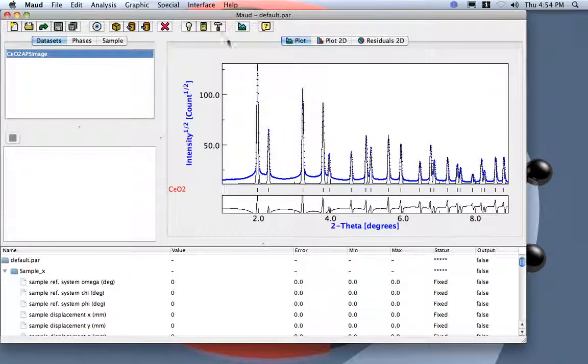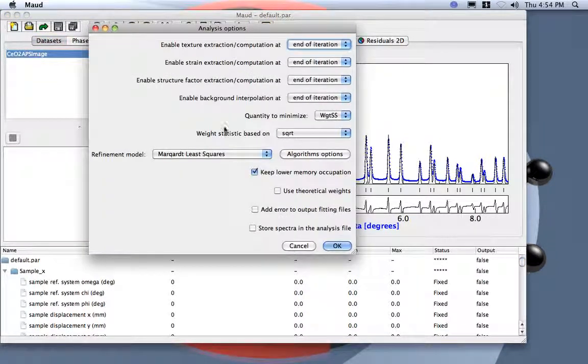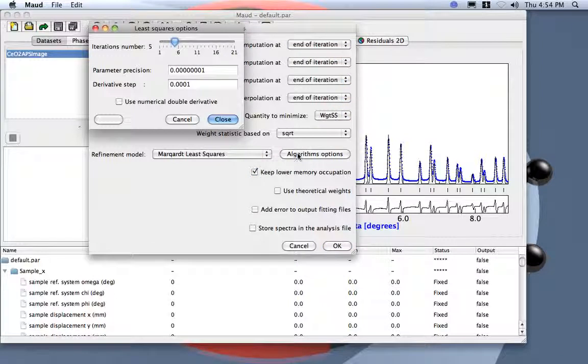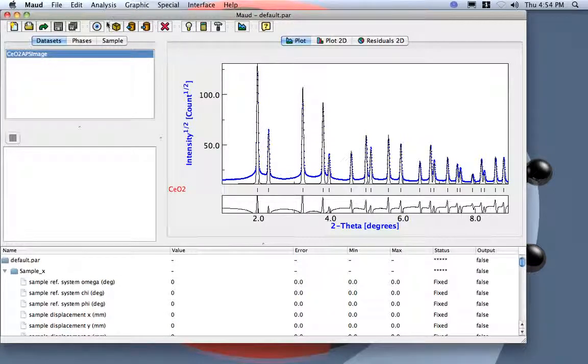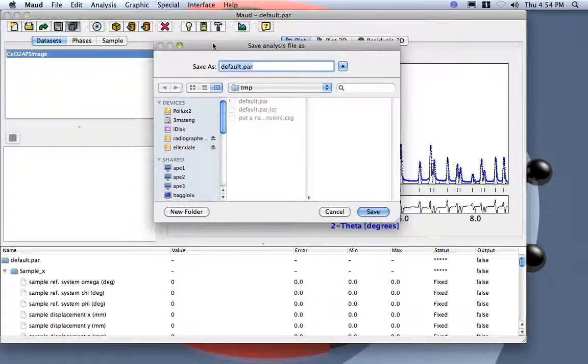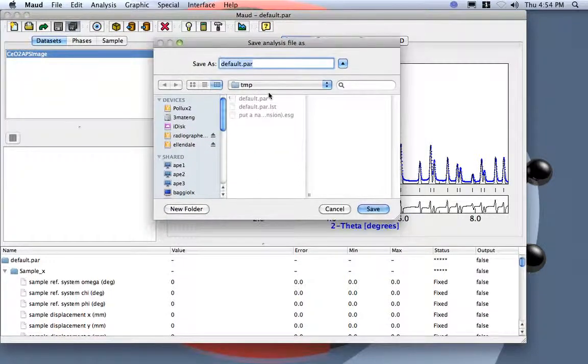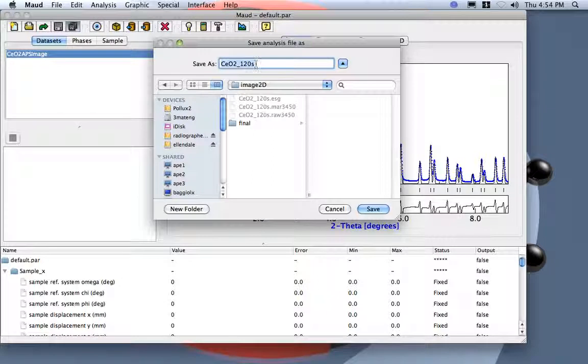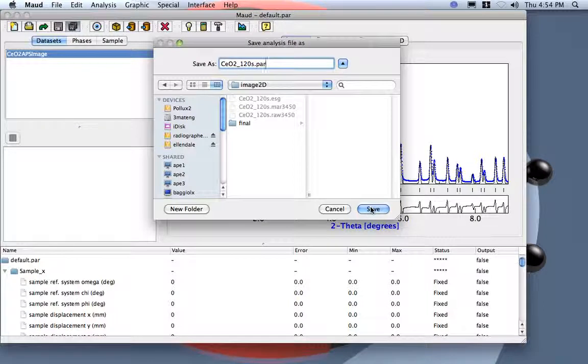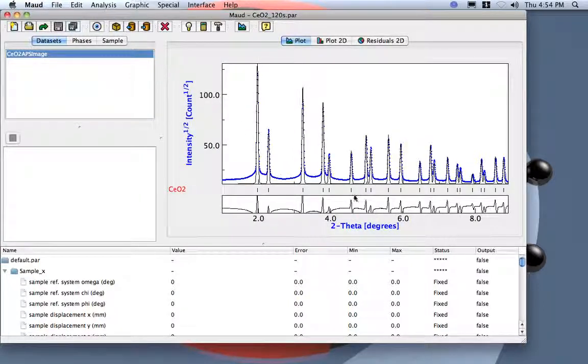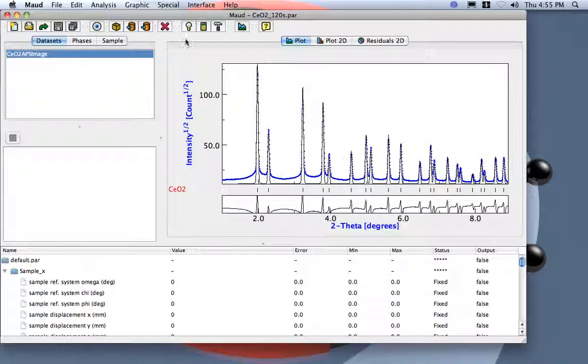Now if I want to check, I can check under option here. We are using the Marquardt least squares and five iterations. Before starting the iteration, normally it's a good idea to save the starting model. So I go to image2D, I save here, dot par, save. So in case something goes wrong, I can recuperate the starting and not do everything again.